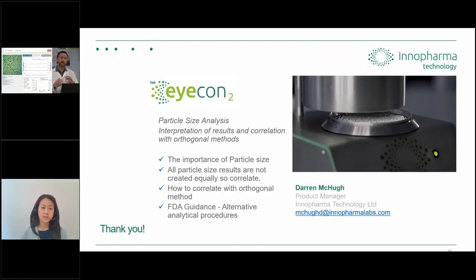If particles are in the background or sitting on top of each other, because of our illumination method, where you can see the red, green, and blue crossover of light hitting each of the particles, we're able to do edge detection of where maybe half a particle is sitting behind another particle and correctly match the two of those. So it does depend somewhat on what method you're analyzing, but also something we will consider for integration is sample presentation and representation.